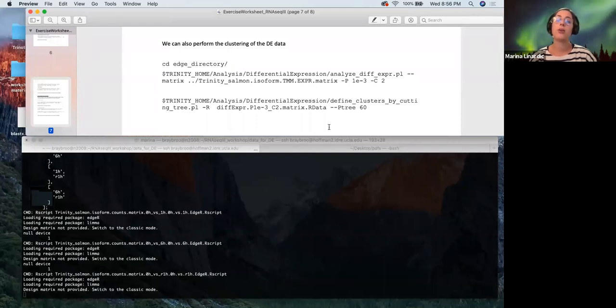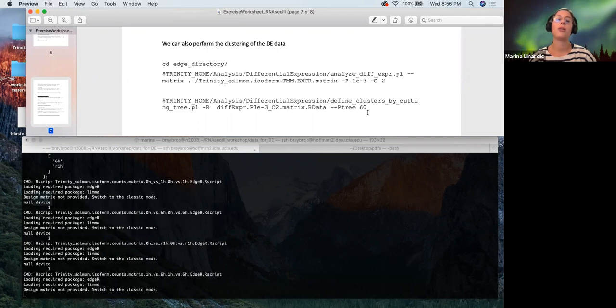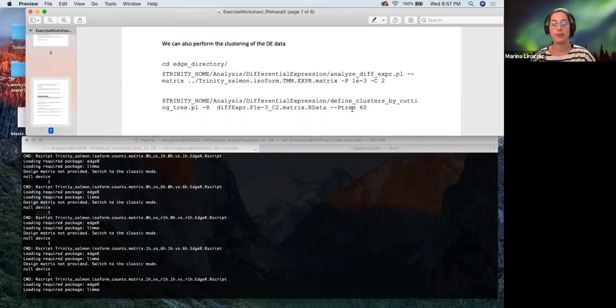And then after that, we're going to also do the clusters by using this program right here, this script right here, using data that's going to practically come out of this first command. And this is just another parameter to set up how you want your cluster trees to look like, how big you want the clusters practically to be. This can be modified as well within the software. The most important thing I would say is just to try it out and see how it works, which one works best, I guess.